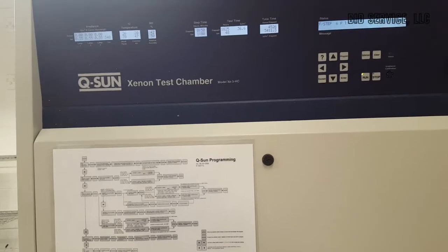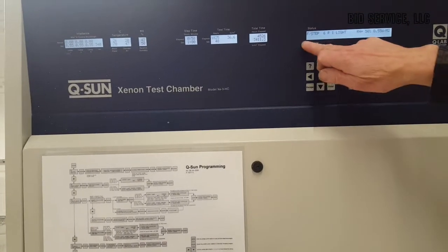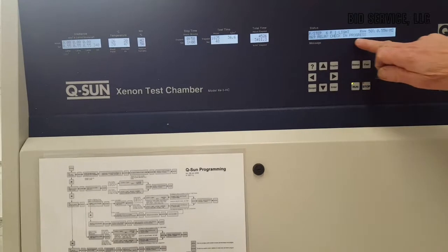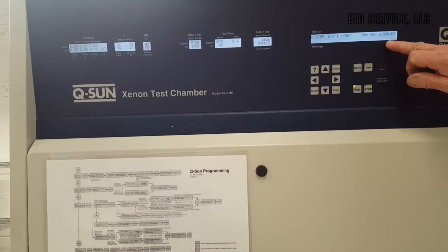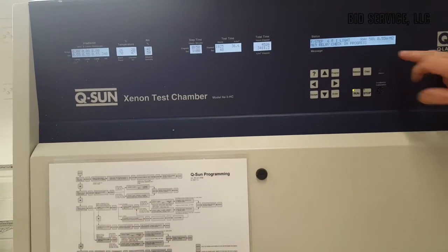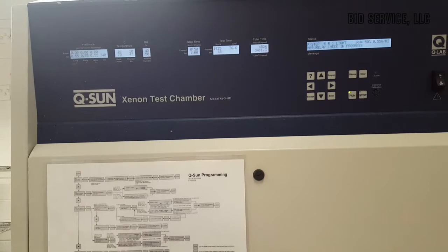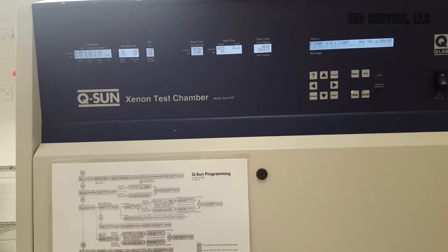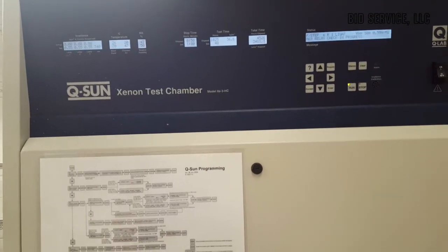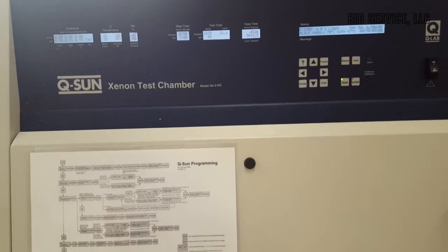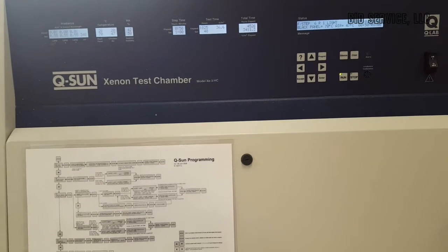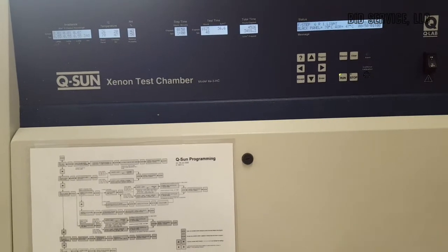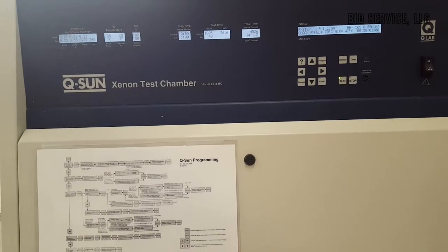The first thing that will appear is this message here. This is not actually an error, but it has a timed startup period where it runs the cooling blower to try to unify the temperature inside.